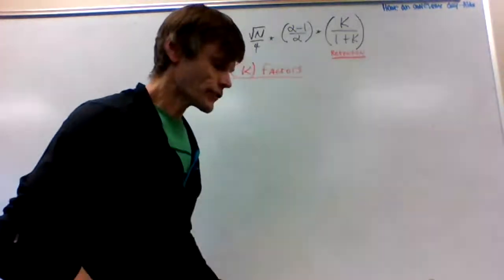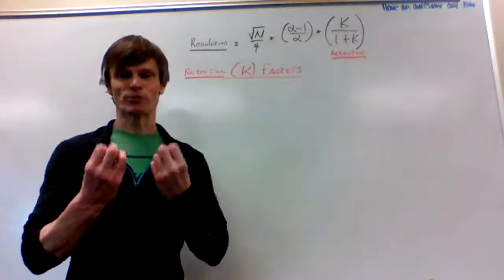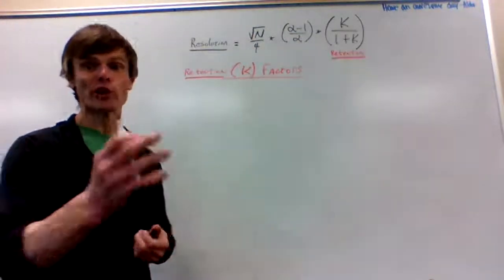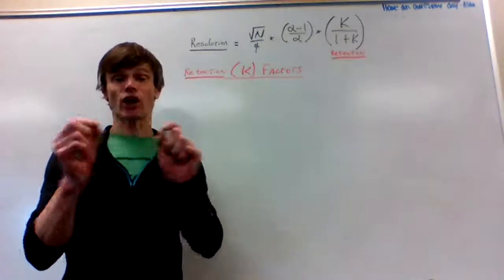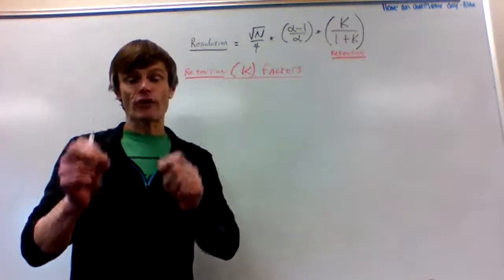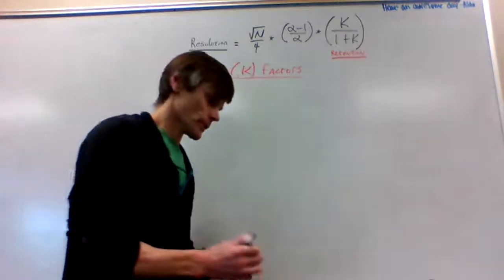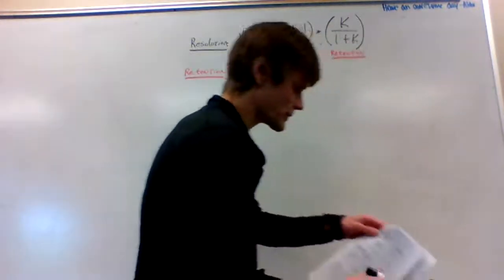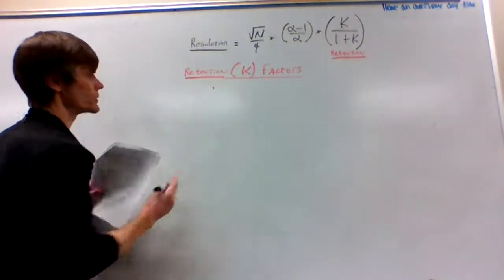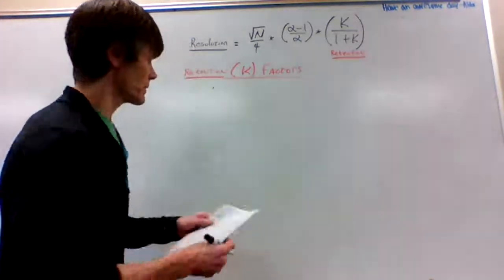So let's think about changing some parameters. Again, the elution problem that we discussed earlier. Let's look at another chromatogram. I think it's important to look at these to see how we can make changes and encourage separation and resolution, and then how we might make other changes so we get good time for our analysis so we can go home. So let's think of factors that we can change. And again, these factors depend upon the environment where we're conducting our experiment.